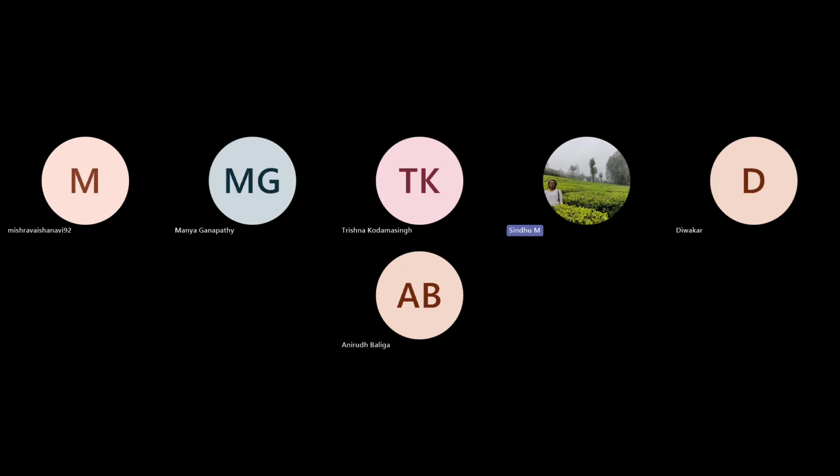And before you do any kind of analysis, just change the properties. So this I did by doing Control-Shift-P. That is the keyboard shortcut. And these are not Z slices, these are time series. So I'm making it time.